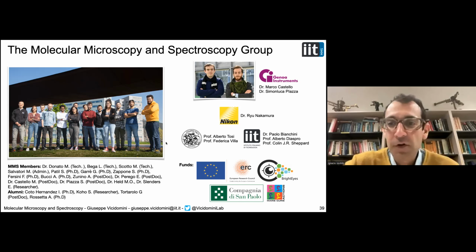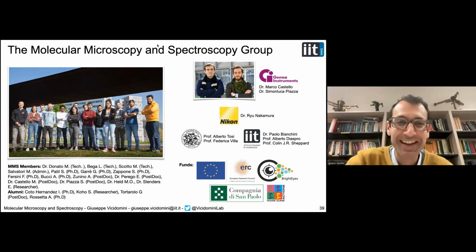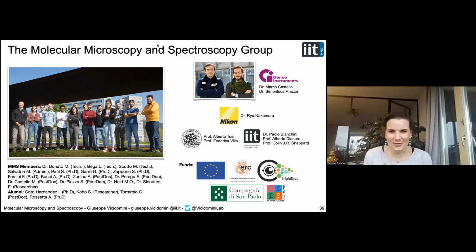Thanks a lot for the answers. There is another question for Sabrina, and I also have a quick question for Sabrina. So Huyen Shu is asking in the chat, what does AX mean? There is no real meaning for AX, but actually the A was for our series of confocals. One was the first confocal, well, actually not exactly the first one, but the X is for the 10th generation, basically. So this is it.